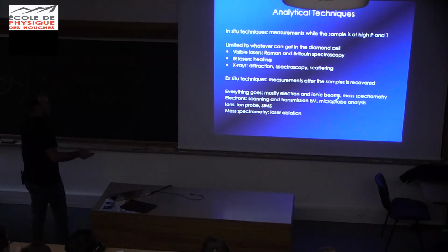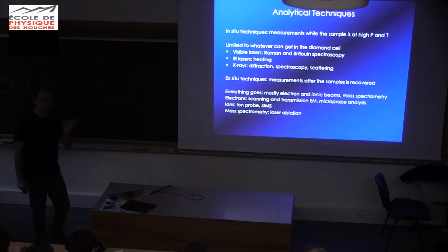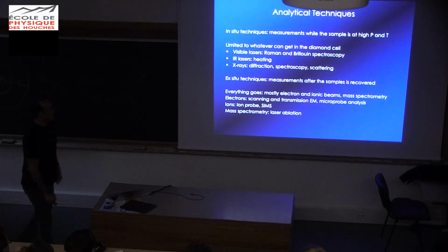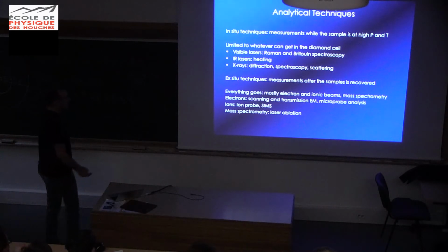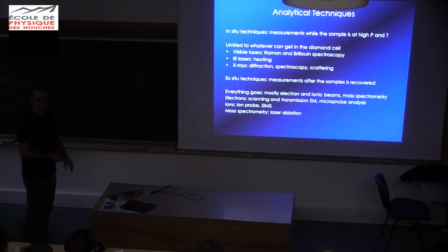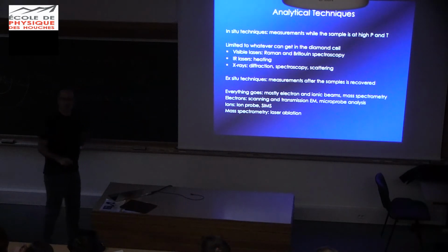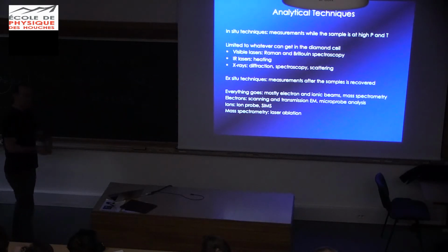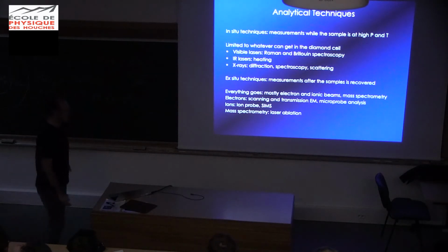And this is mostly electron and ionic beams. You can do mass spectrometry. You can do scanning and transmission electron microscopy, so you can now start probing your sample at the nanometer scale. You can do microprobe analysis, where you can measure the composition of tiny parts of your sample with very high analytical resolution. You can use ions, like cesium ions or oxygen ions, or lasers to do laser ablation mass spectrometry, to measure, I don't know, isotope ratios or concentrations of trace elements with very high resolution on those high pressure phases. They're not at high pressure anymore, but whatever they froze from their high pressure, high temperature life is still there, right?